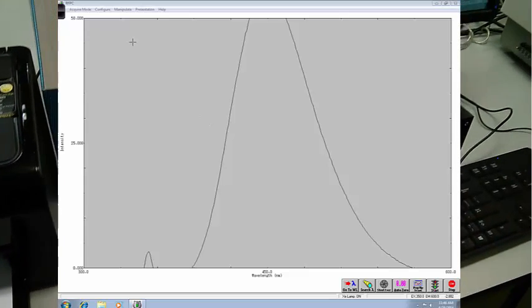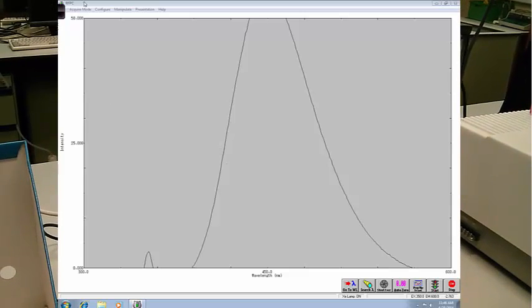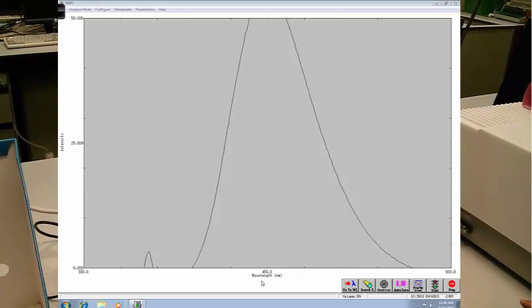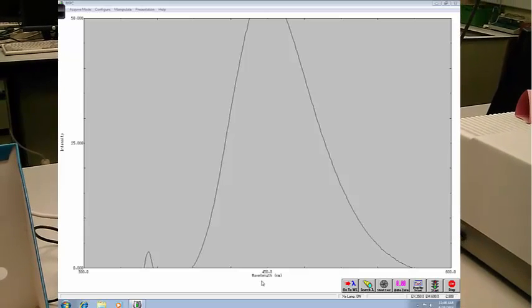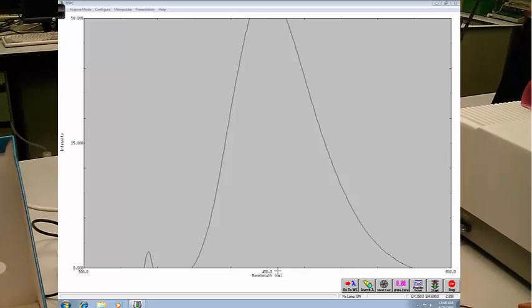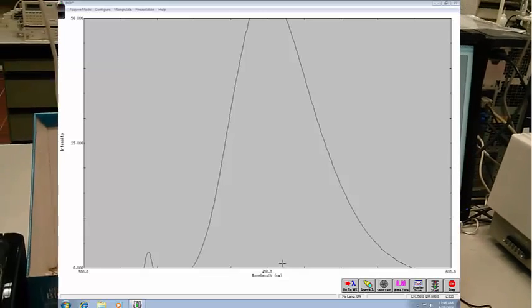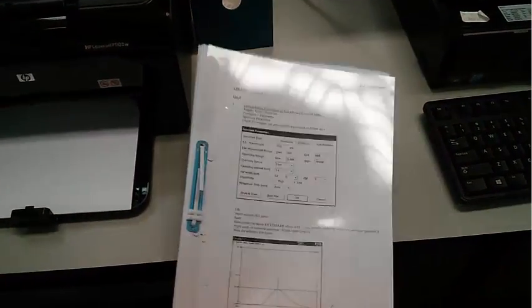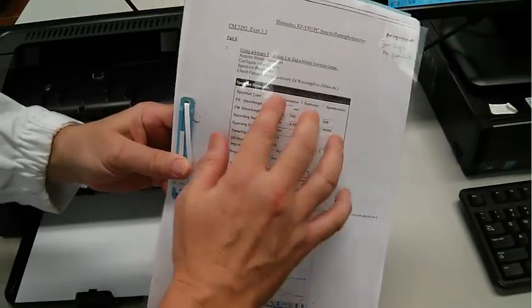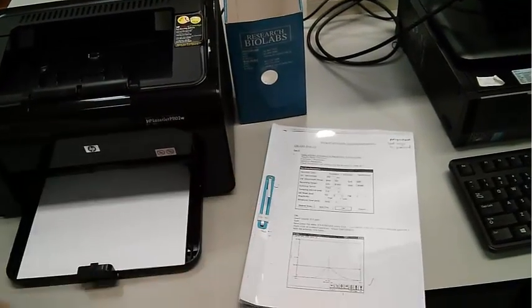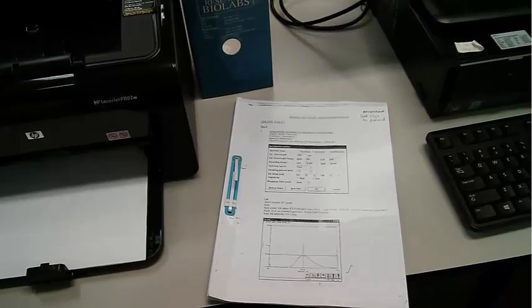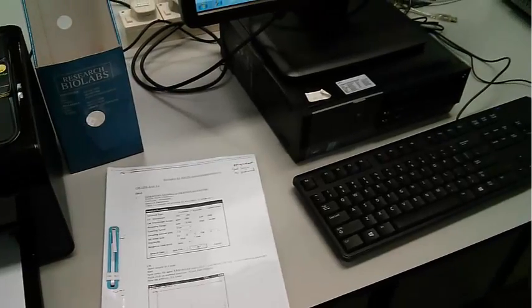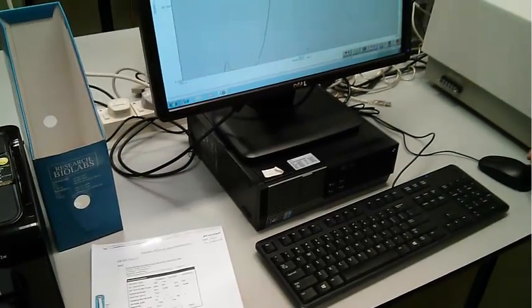Now we've got our emission spectrum. We need to run the excitation spectrum to find between what values that our compound is going to be fluorescing, and that's all described in here. I think probably because you literally have the menus and the settings in these instructions, rather than us walk through it, we're here to show you about the equipment rather than the actual practical. I think probably we should say goodbye.